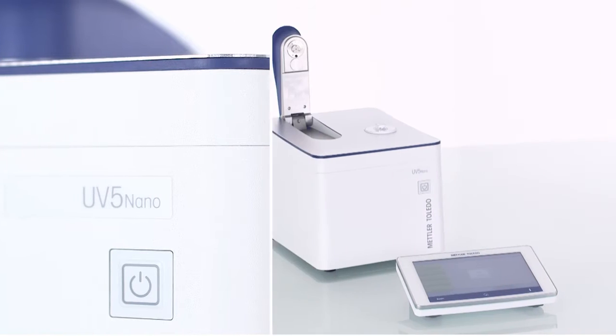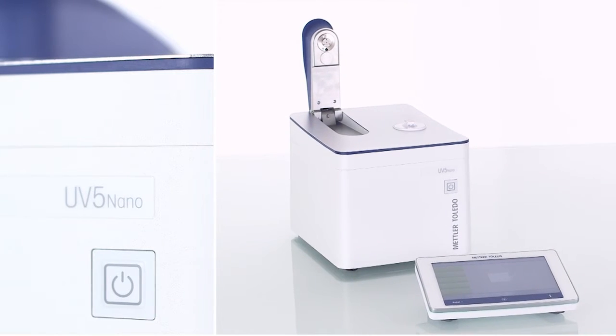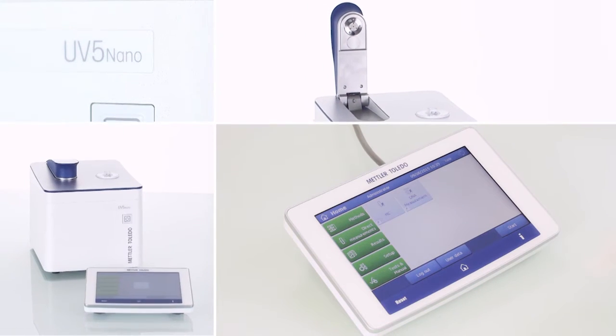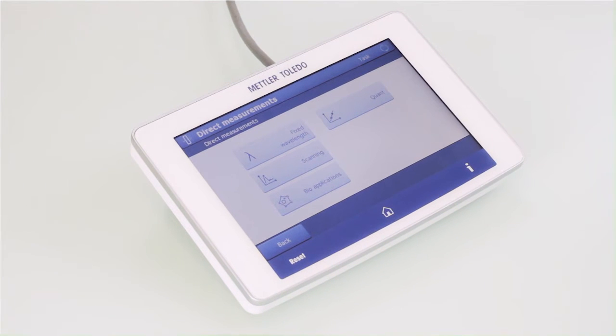DNA measurements are made simple with Mettler Toledo's UV5 nano microvolume instrument. For quick measurements, simply select a direct measurement from the terminal home screen.